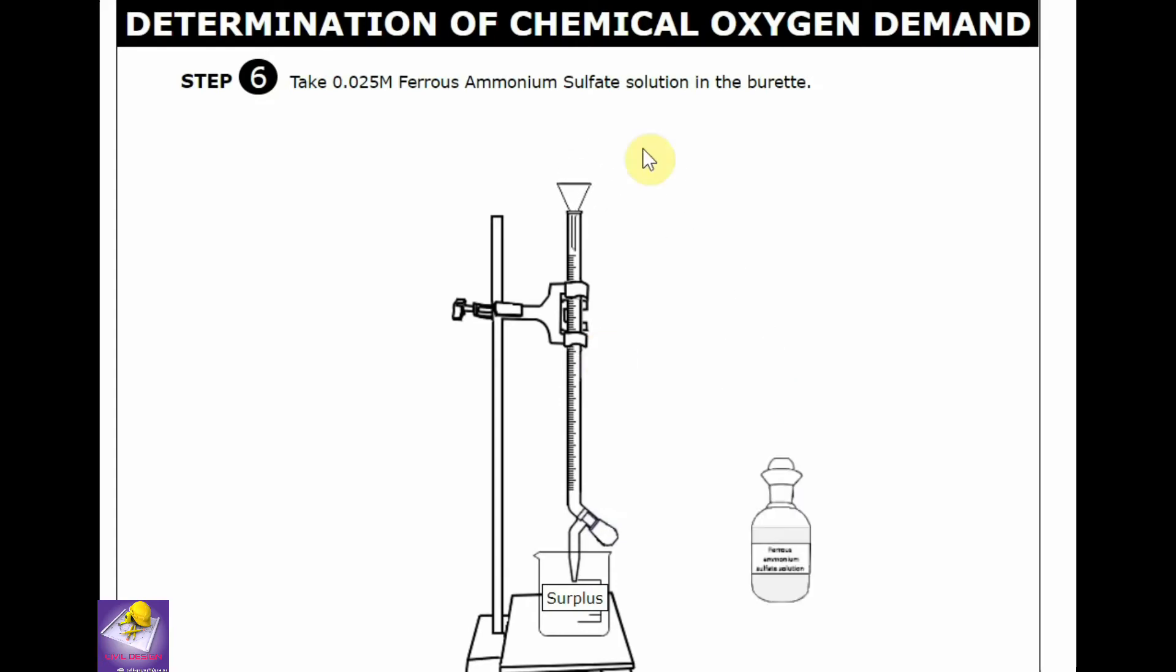And now add 0.025 M ferrous ammonium sulfate to the burette. Set the reading to 0 on the burette.